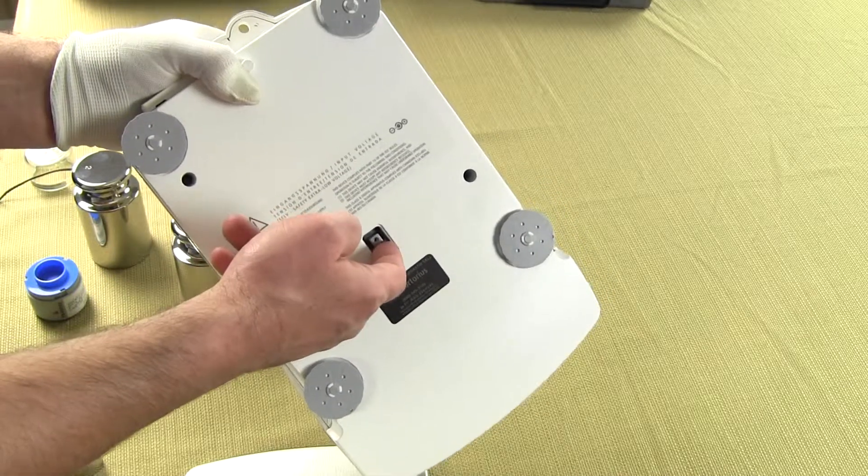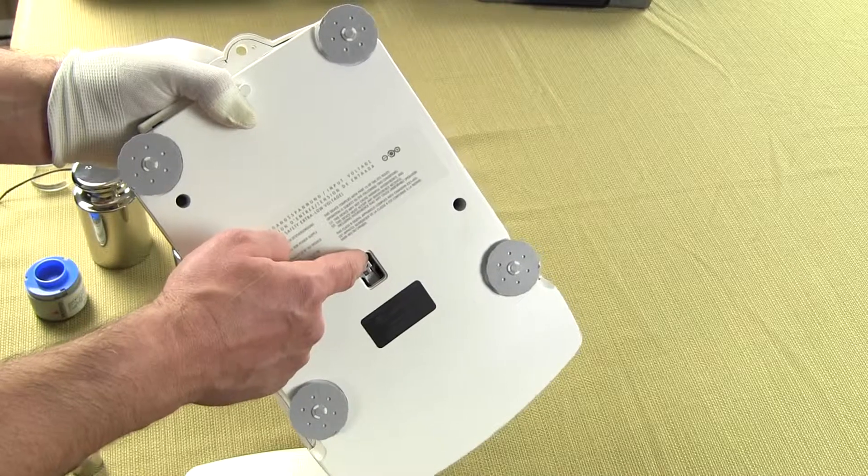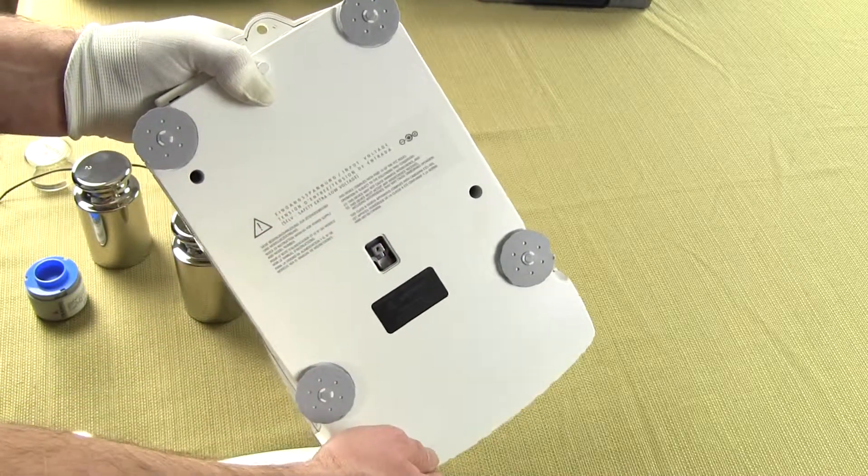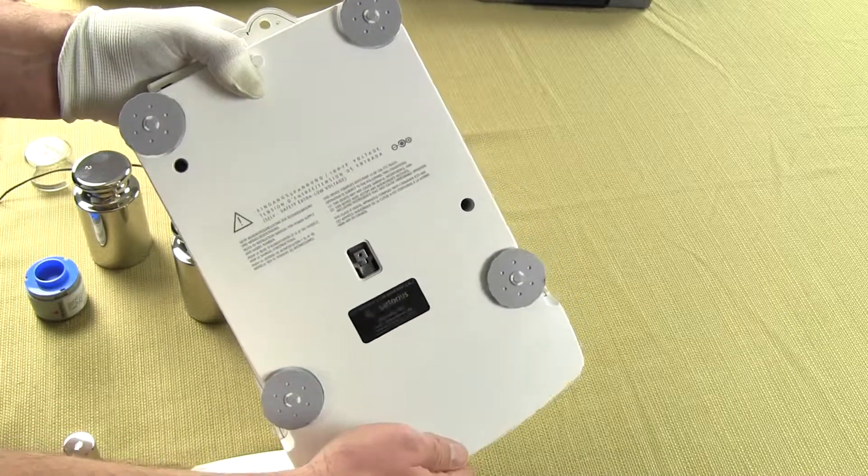So you could hang a wire on this side or there's an optional hook. It's about a three millimeter bolt here. Sartorius does have an option that you can buy the hanger or you can put the wire right on this side. So this balance has an underhook.